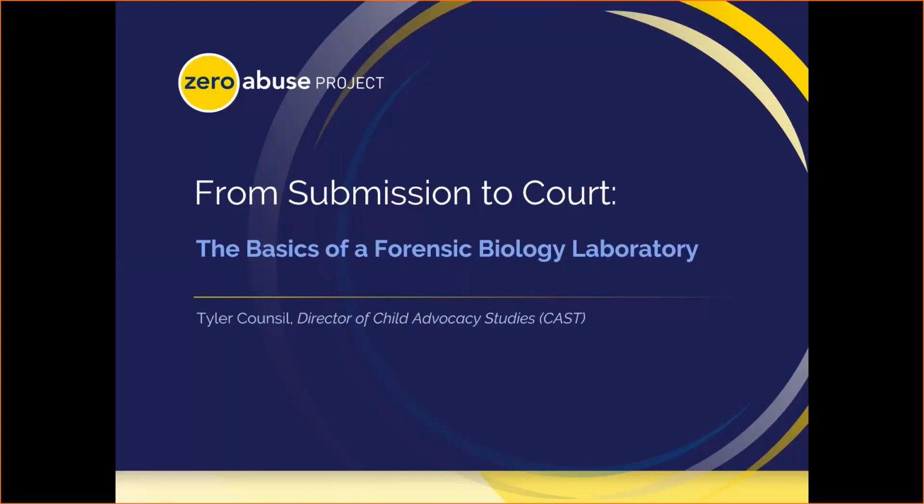I'm also a forensic scientist with almost a decade of lab experience. Forensics and our laboratory processes are incredibly important to your child maltreatment investigations and prosecutions. So I wanted to empower you all in attendance today with information regarding the basic pathway taken to process your biological evidence and the methods used to validate our test protocols, so that you have a greater appreciation for the effort that goes into analyzing your samples for subsequent report dissemination and testimony in court.